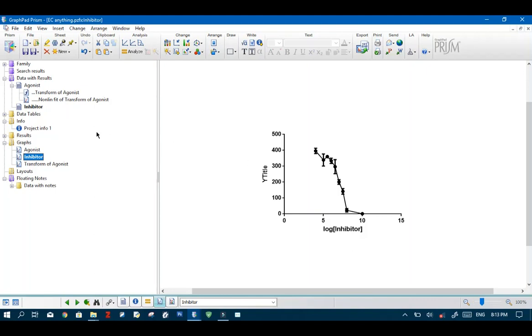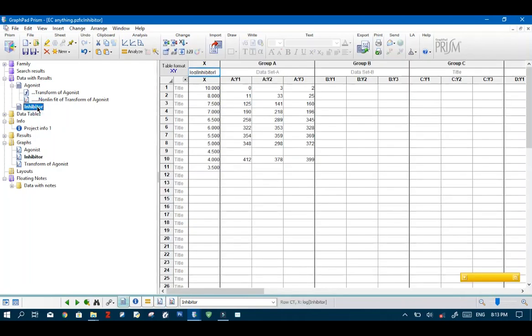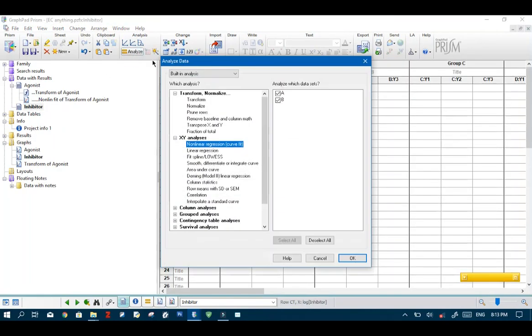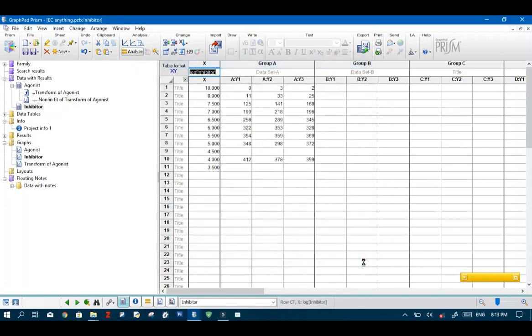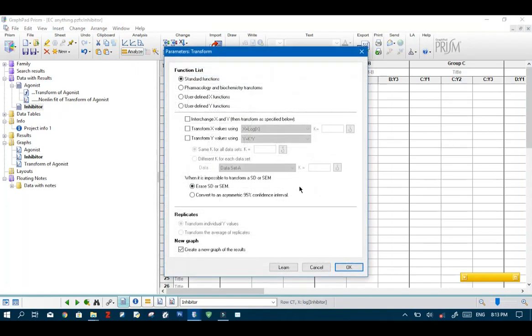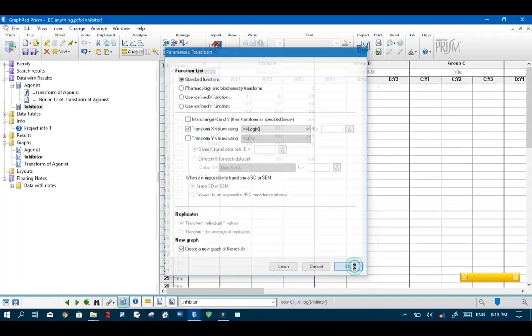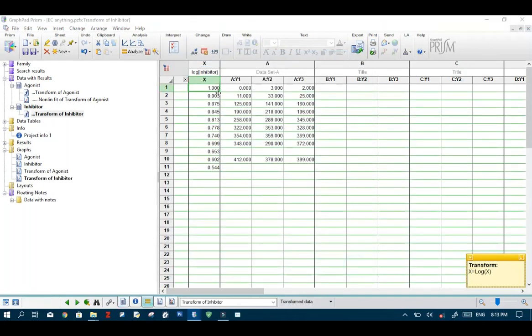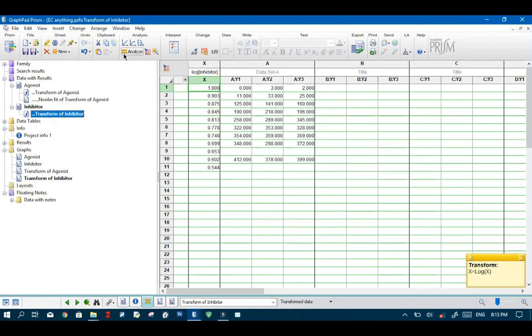I want to go ahead and do it. So select your data sheet and like we did before go to analyze. And we are going to transform the X axis values like we did before. So check this box. Make sure X equals log X is selected and hit OK.